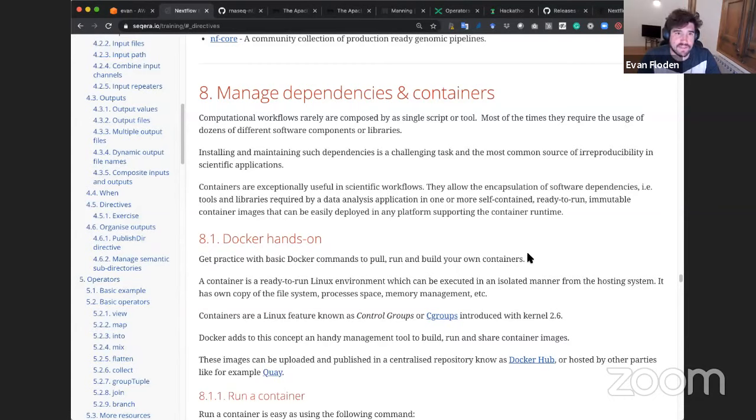And then for the second part of tomorrow, we'll look at Nextflow config itself, and the options that are available to us in the config, how we can structure our config files, use profiles, etc.